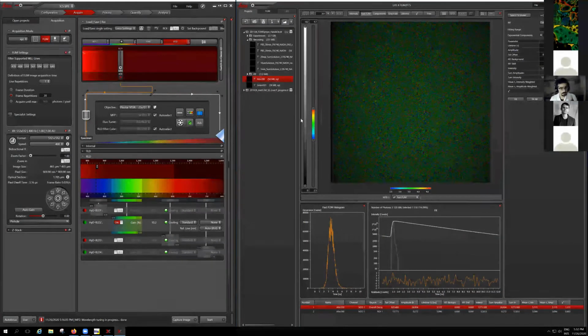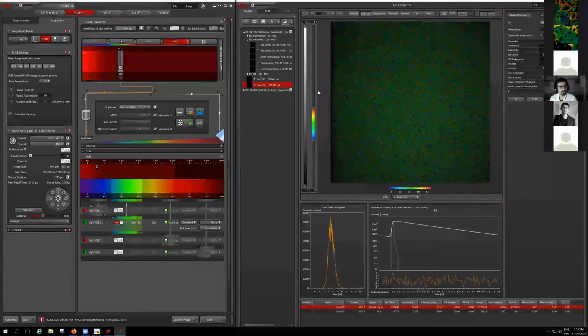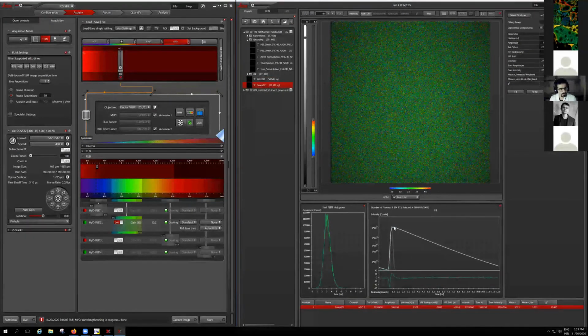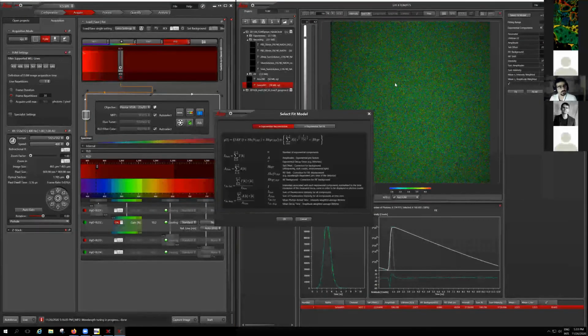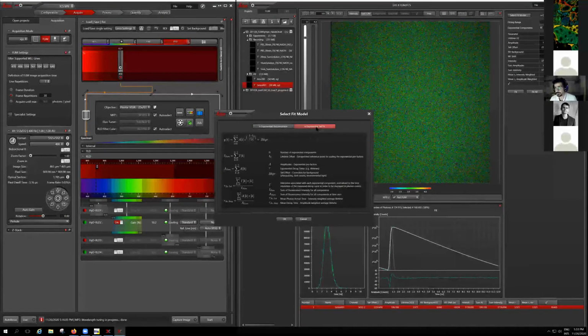One thing that I would like to try: now I have this long decay curve, and I see that the measurement was not really responding well, and there is a problem in the beginning, in the very short lifetimes. What if I use the tail fit? So now I have a long lifetime, 3.6 nanoseconds is relatively long.